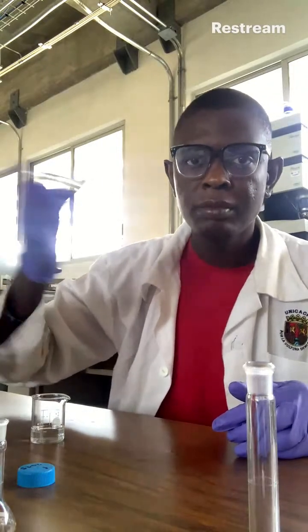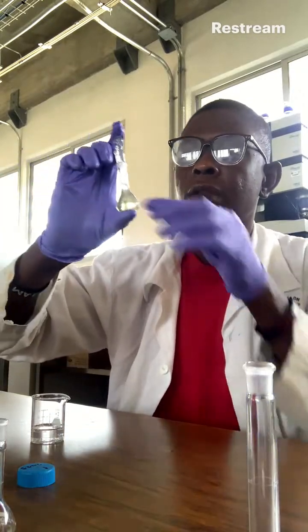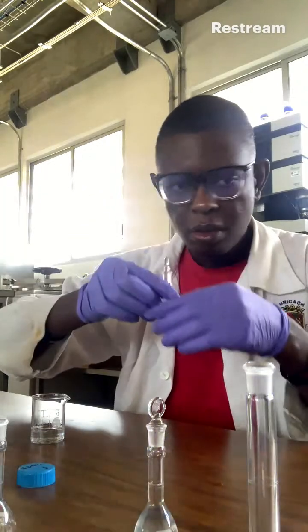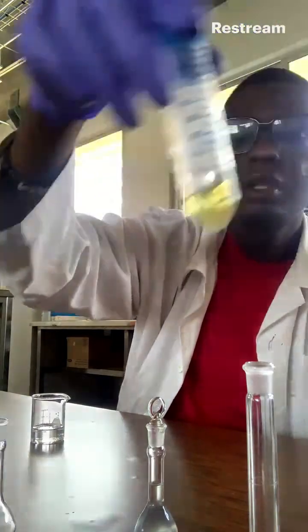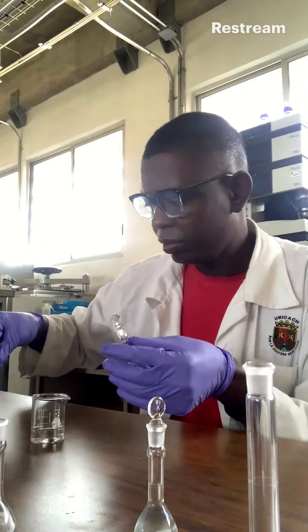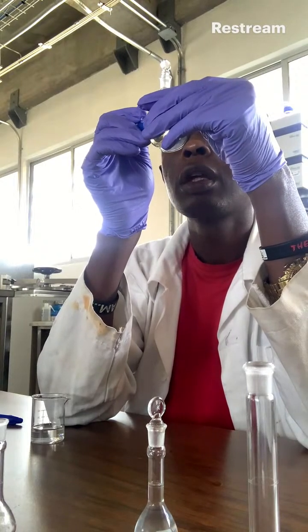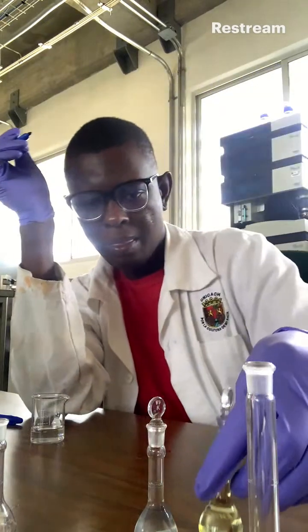I'll shake it. I have diluted it with isopropanol. So this is GC agave.